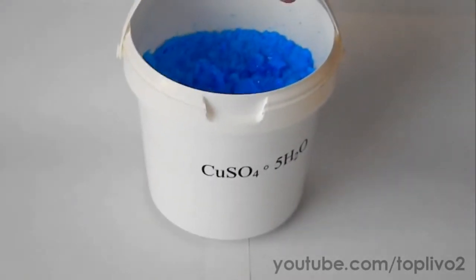Hello everyone! Today we'll grow beautiful single crystals. Crystals can be grown from almost any salt. However, for a better result, I suggest using the copper sulphate one.